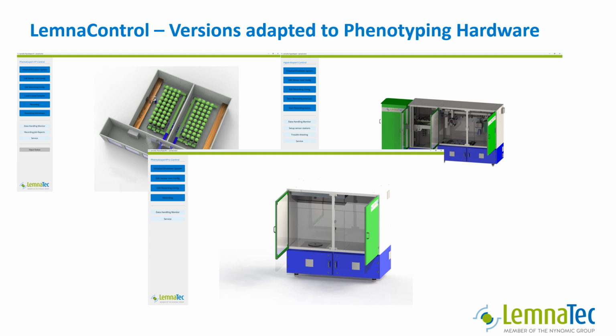In the rest of the presentation, I focus on the PhenoAIxpert Pro. For each phenotyping system, we have a dedicated training. This also comprises the differences in the LemnaControl interfaces. So if you are working with a specific system, please refer to the training for your system.